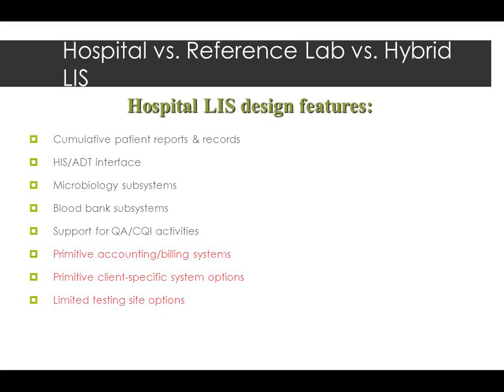We need to be able to, especially on the inpatient units, now I can look it up in Apex and I can trend it and I can even graph it in Apex. If I want what's the patient's glucose been doing. Previously, when I first got here, we printed out a cumulative report for every patient every night. And so it would be multiple pages, but all of the glucoses would be in one place, so a doc could look at all of them simultaneously. Okay, the EHR has taken that away, but we needed cumulative patient reports and records.